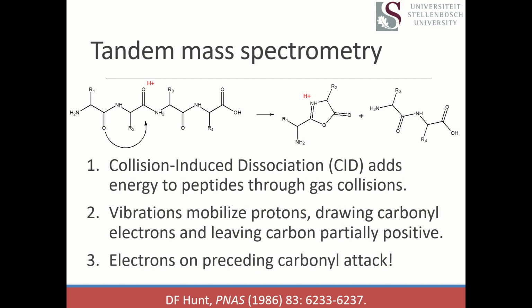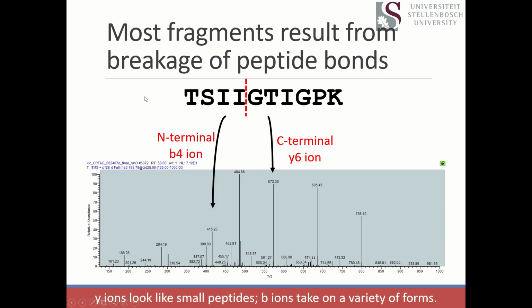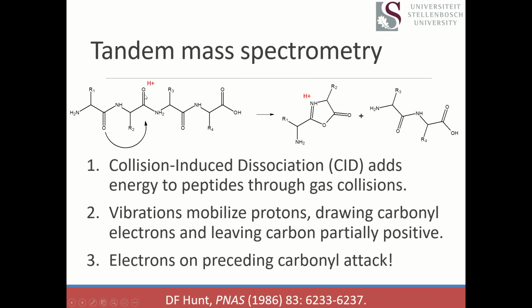So those protons start moving around when we energize the peptides in this way. And occasionally, you'll get one that sits down on a carbonyl. Now, I'm sure you all remember and love organic chemistry. And so you remember that a carbonyl is a C double bonded to an O. So imagine a proton sitting down on that O, in that spot where we've got that little red one there.